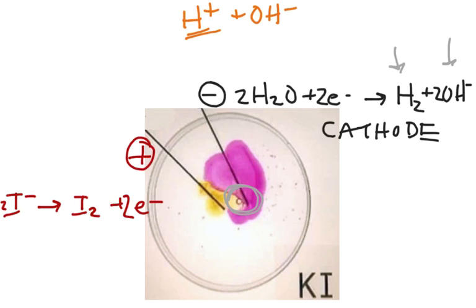On the other side, iodine does not dissolve all that well in water. If this were a nonpolar solvent we'd get a nice purple color, but what we're actually getting here is iodide mixing with iodine, and we're getting I3-, which is kind of an orangey color at this concentration. So this yellowy, orangey color is forming here. That's what's happening when you're doing electrolysis of potassium iodide.